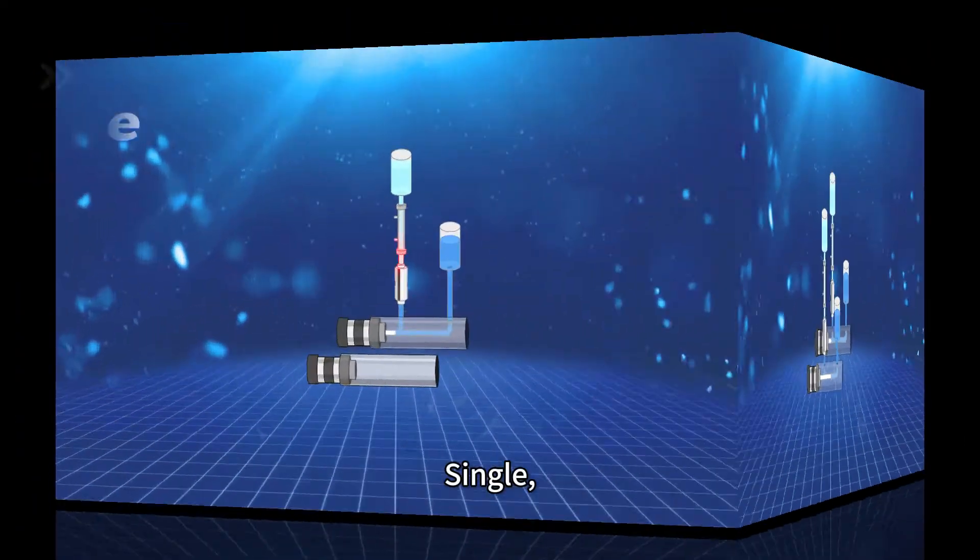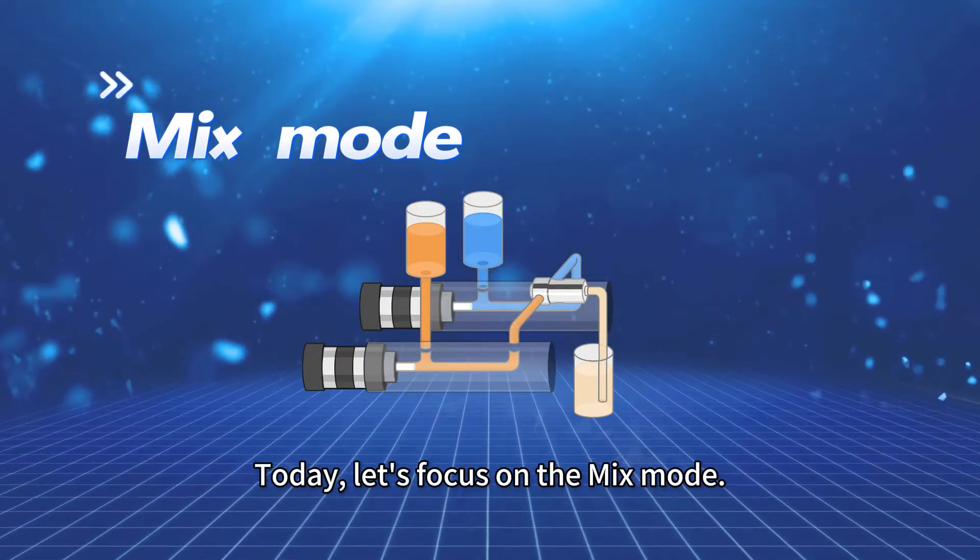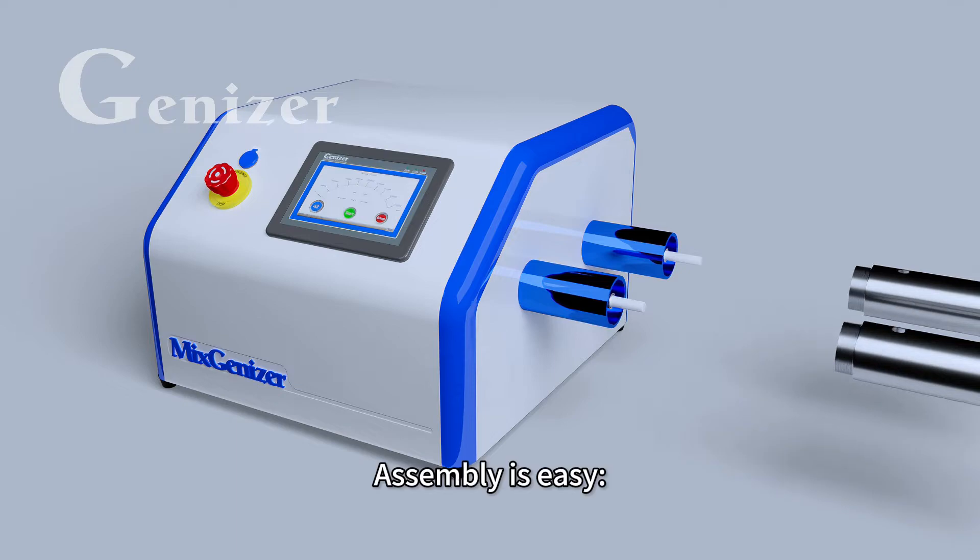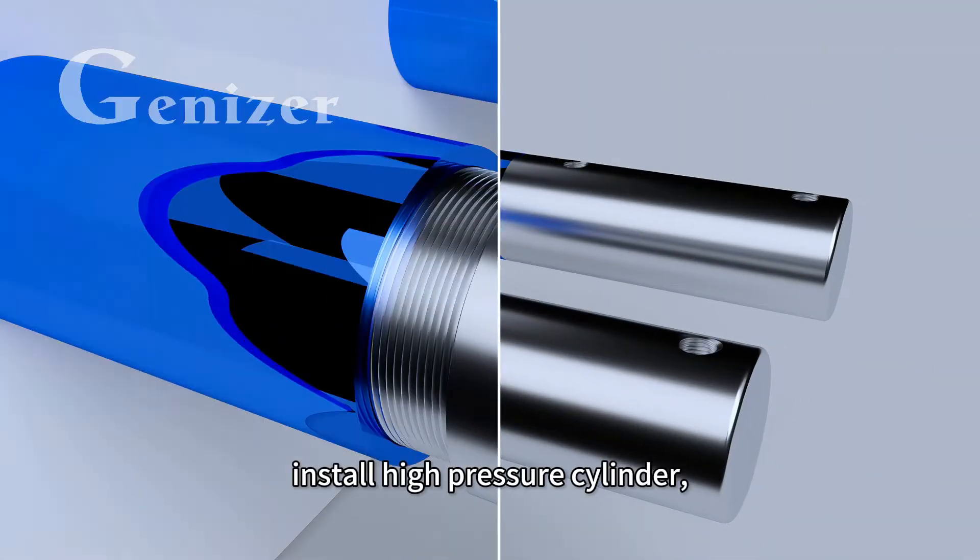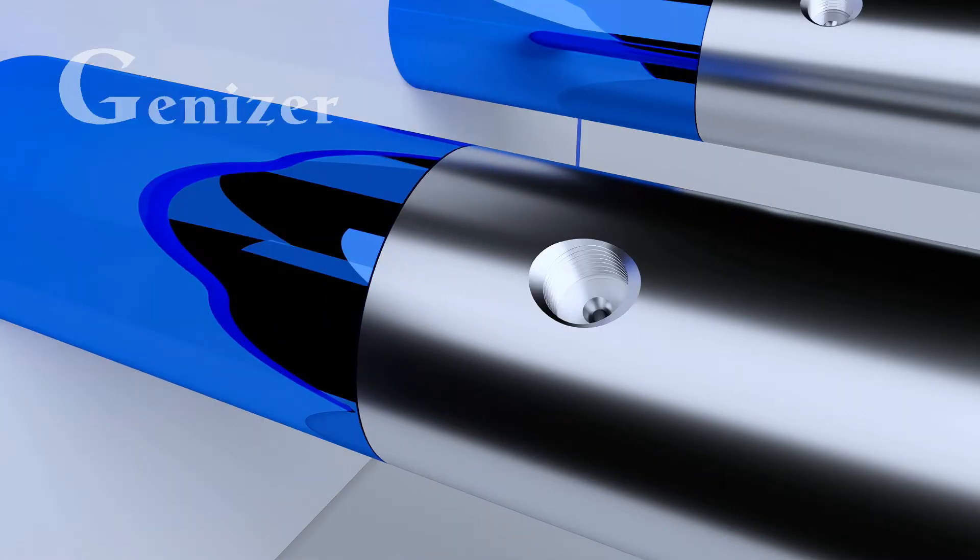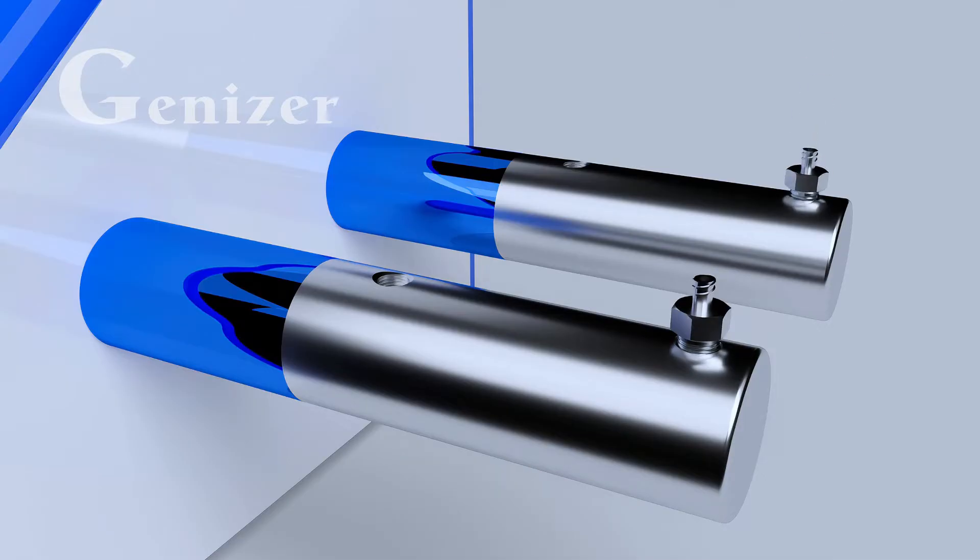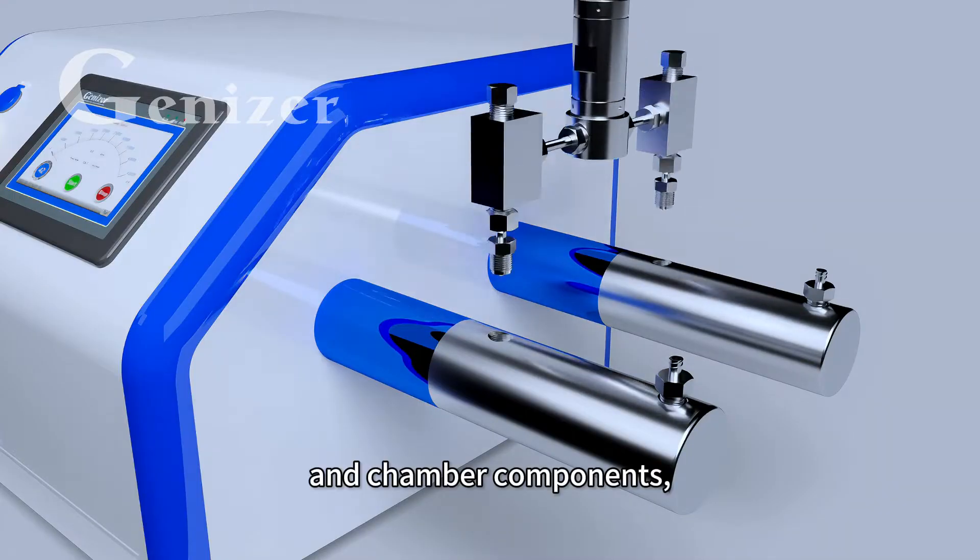Dual, single, and mix. Today, let's focus on the mix mode. Assembly is easy. Install the high-pressure cylinder, inlet check valve, and chamber components.